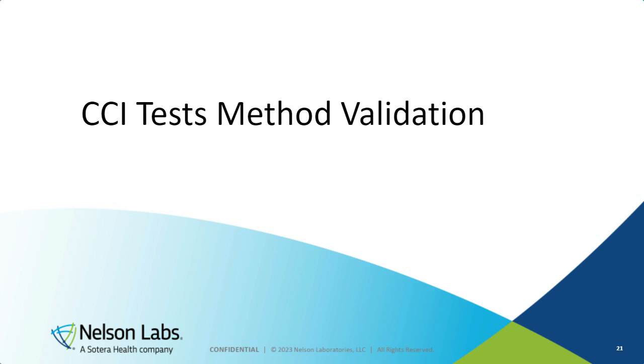Now, this last part here, I would like to go through how one would validate a method and what you would be looking for. In doing so, I'm going to use mass extraction as an example, and that's obviously because I validated the mass extraction method at Nelson Laboratories. I have access to the data from that validation and can use that to explain this. But the principles here are going to be the same. Obviously, any vacuum-based method is going to be very, very close to this, and even those detector-emitter methods are going to follow these same concepts.